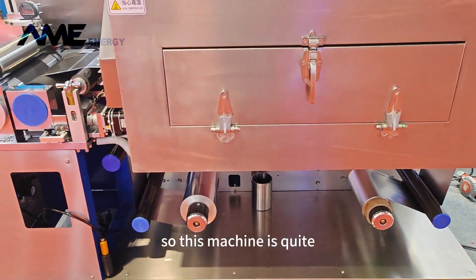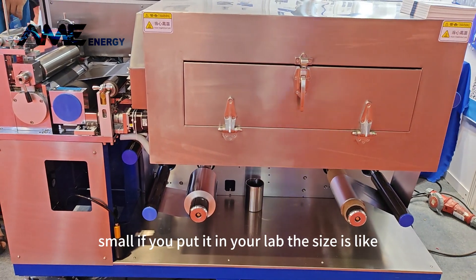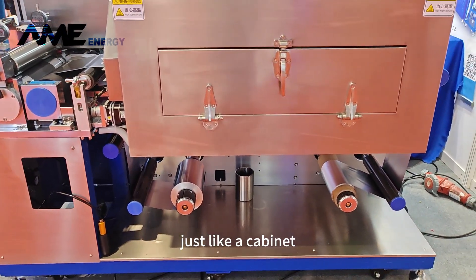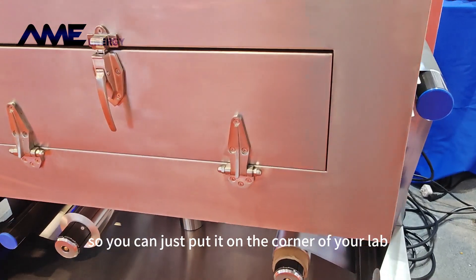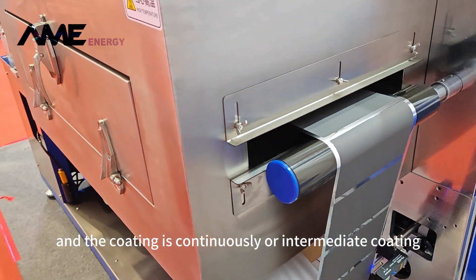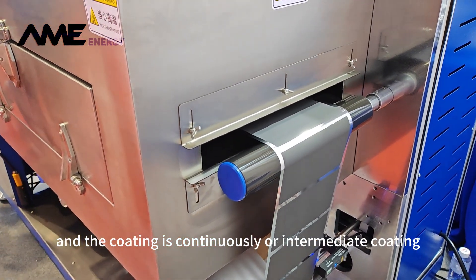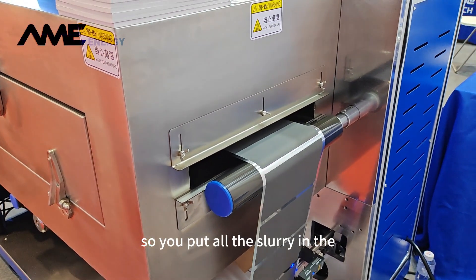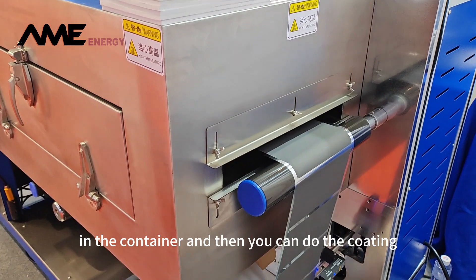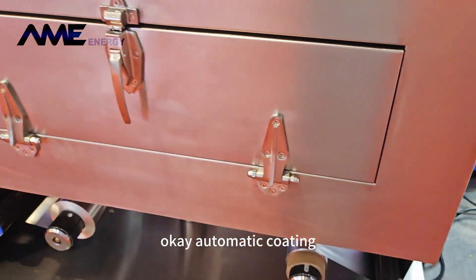This machine is quite small. If you put it in your lab, the size is just like a cabinet, so you can just put it in the corner of your lab. The coating can be continuous or intermittent. You put all the slurry in the container and then you can do the coating automatically — automatic coating.